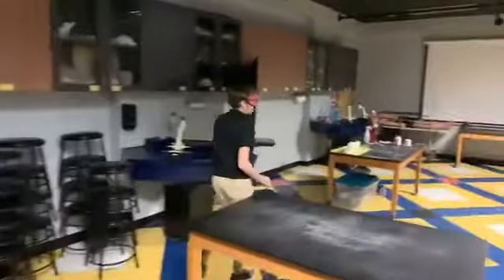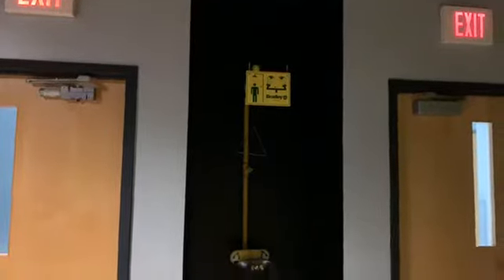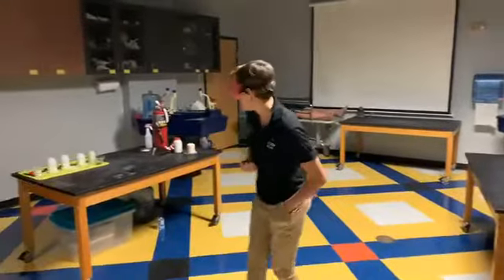And of course, every lab needs to have an eye wash station, just in case you get anything in your eyes. You can quickly go over there and take a shower, wash your eyes out, and it is very, very powerful. We actually had someone pull that accidentally one time, and it flooded the whole lab. So it is very, very strong.